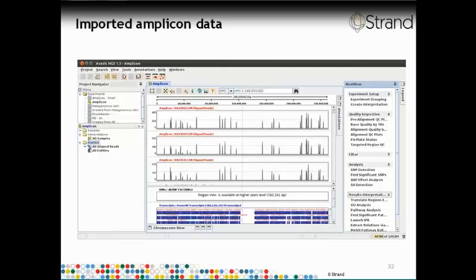One can take a look at the sample count column and see what the distribution looks like. We can see that a vast majority of the variants are specific to only one of the samples, but you do have a small set of variants which are present in all 96 samples. However, we need a robust way of identifying these variants which are present in a large number of samples. So let's try to define what we are after.